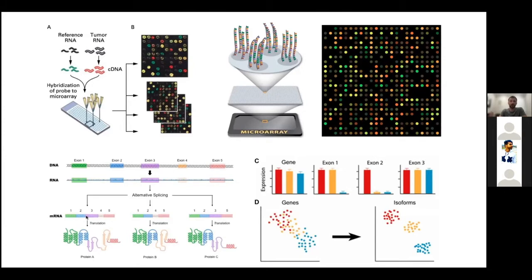And there's more variation to it than just abundance, which is what we can capture in the microarrays. So besides abundance, we can also look at what's called alternative splicing. And I'll talk in a little bit about the process of next generation sequencing, and you will see some of the important challenges that come as a result of this wider dynamic range. So the wider dynamic range here refers to the ability to capture abundance as well as alternative splicing events and characterize this across multiple samples that represent conditions.